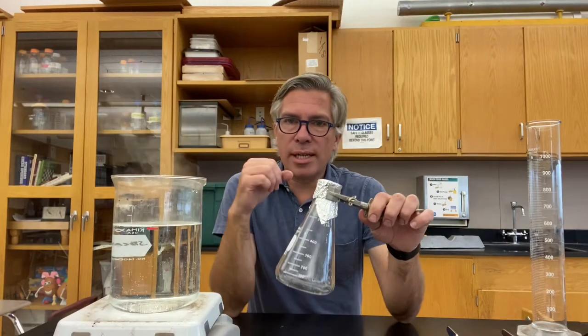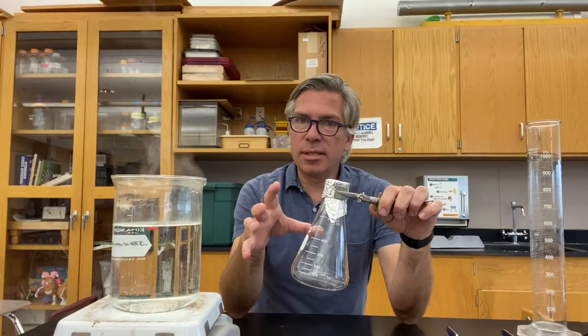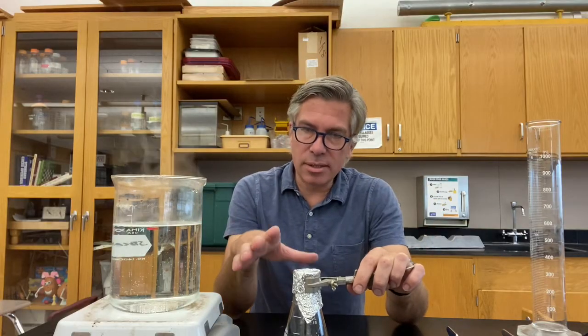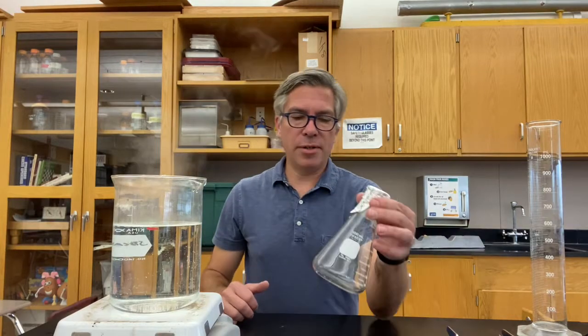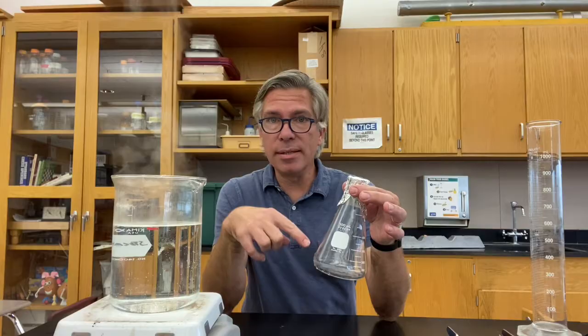At the moment I took it out, the vapor from my liquid was filling up this entire container. And as it's been cooling on the countertop, it has begun to condense a little bit, and I can see a little bit of liquid now at the bottom of my flask. Now to finish this up, we're going to have to take some measurements on this liquid that remains inside the flask.